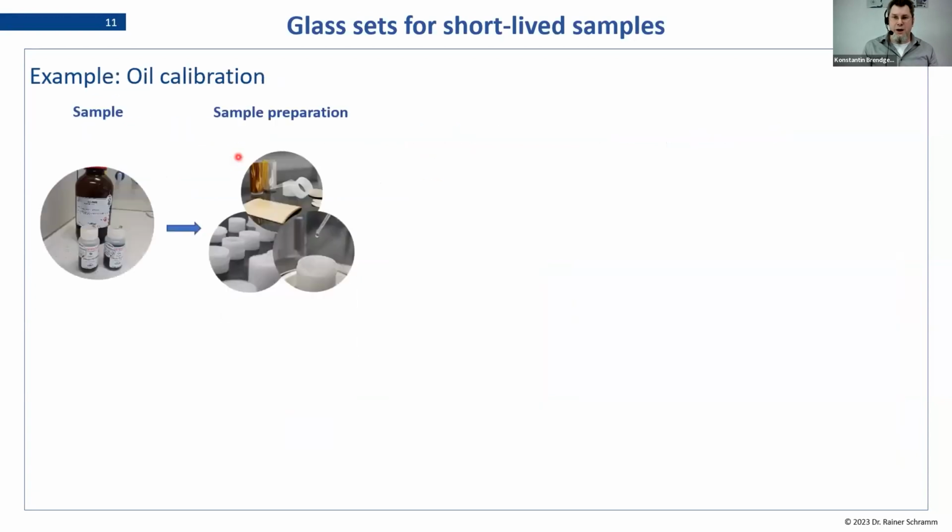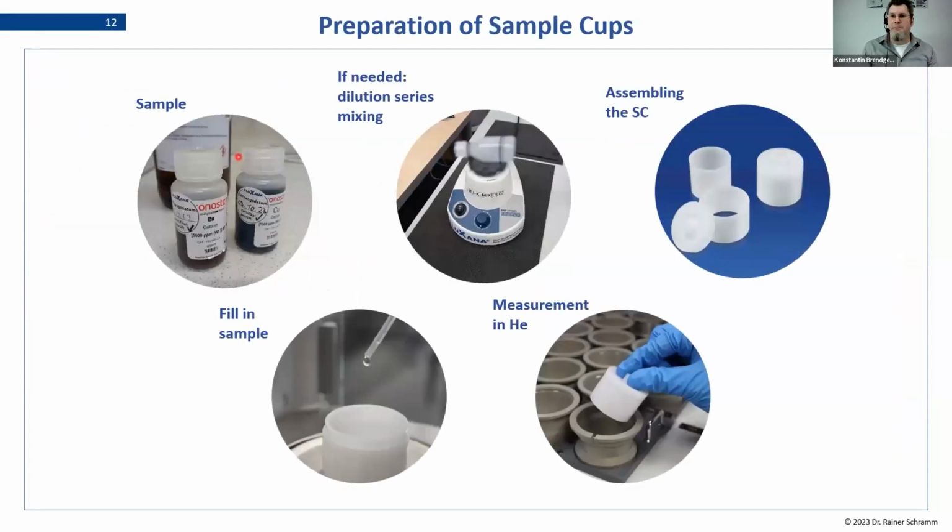And when we're looking at the calibration, we're going to sample prep now. We have our sample. For a calibration, like I said, we have multiple single element standards. We make a dilution, or if we use the standard as is, we simply mix them before measurement. Usually what we do is we take the high concentration point and we dilute it down to get a calibration. As an example, we might have a 1,000 ppm standard, and we go down to 700, 500, 300, 100, 0. So we use one standard that we bought to make a dilution, and we use up that material in the process.